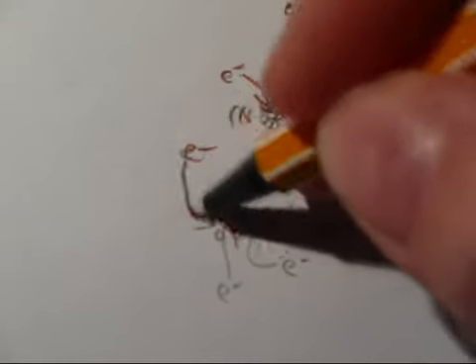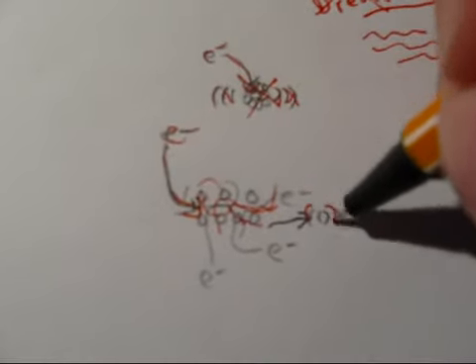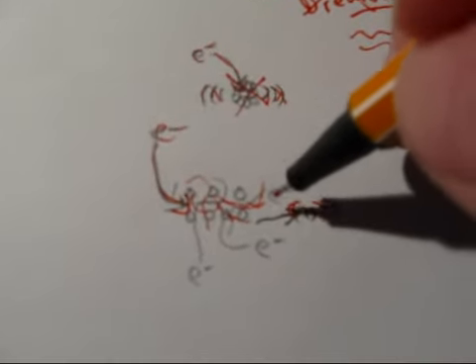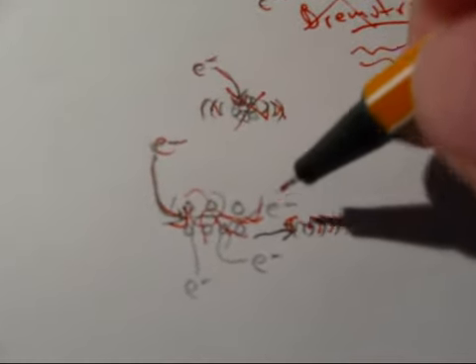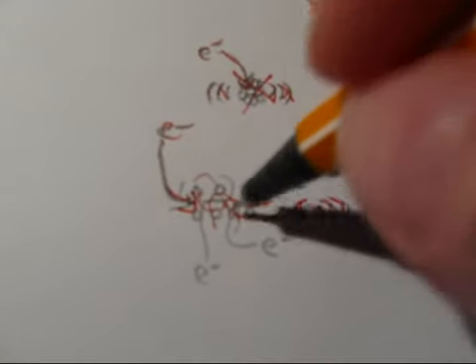And an electron from our beam may actually get in there and excite things, so they start to oscillate and induce currents. So that's basically a bit like static electricity. The sample may just be charged up, if you want to put it that way. But this is not useful for analysis either.